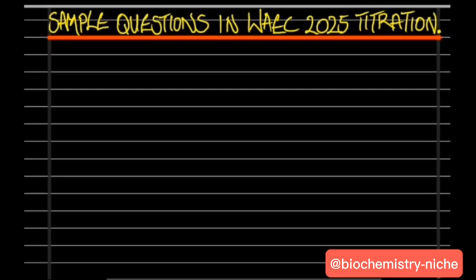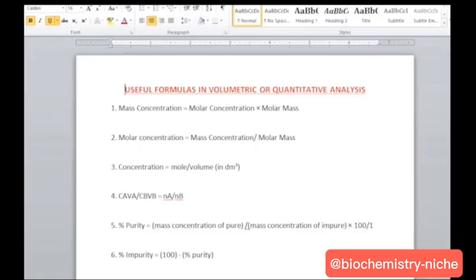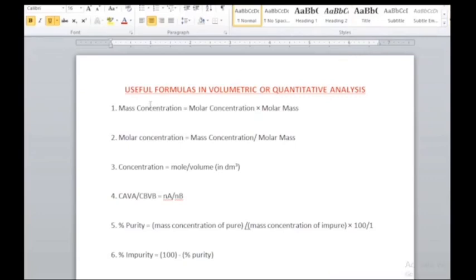Before we go into listening out our questions, let us quickly see a couple of things that can help us in answering questions, and talking about useful formulas in volumetric or quantitative analysis. Here we have some formulas that have been itemized that could be very handy in writing the examination.